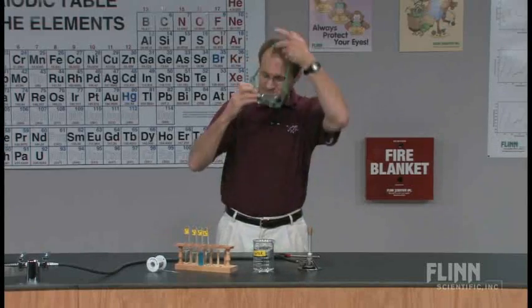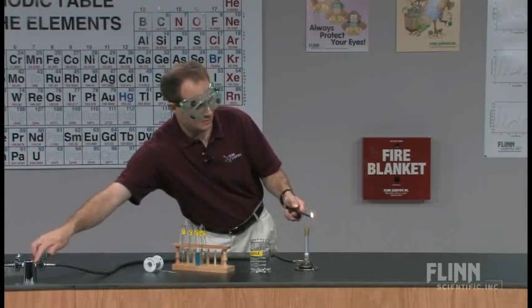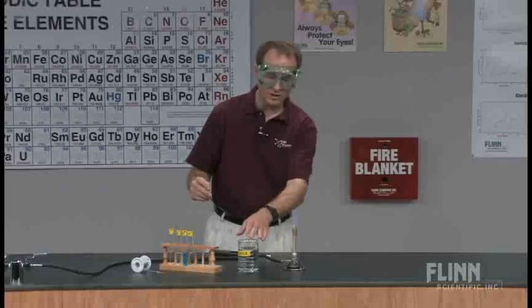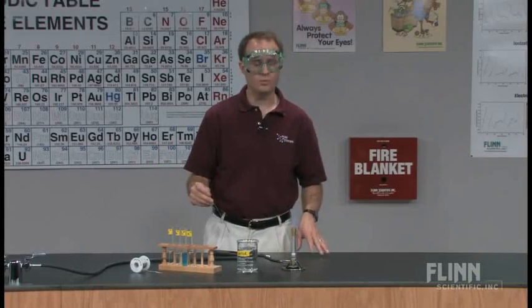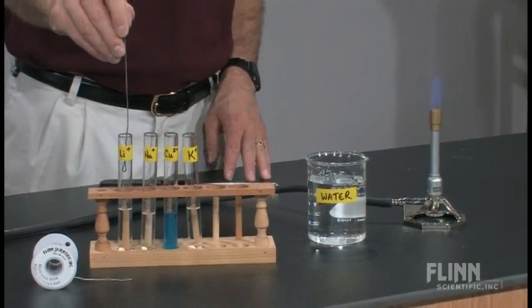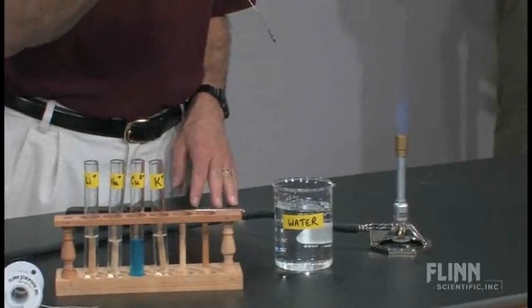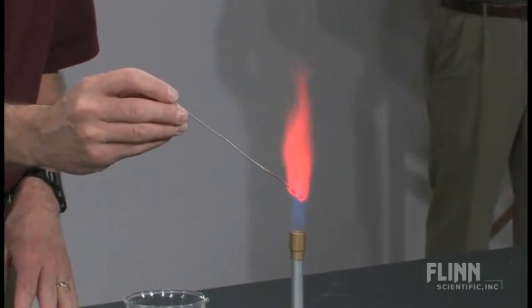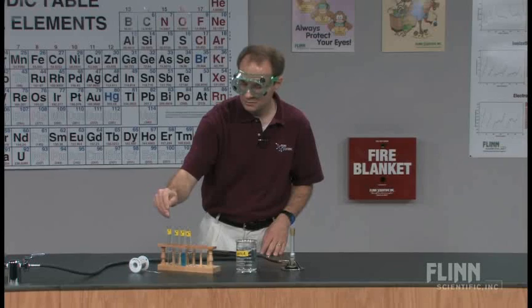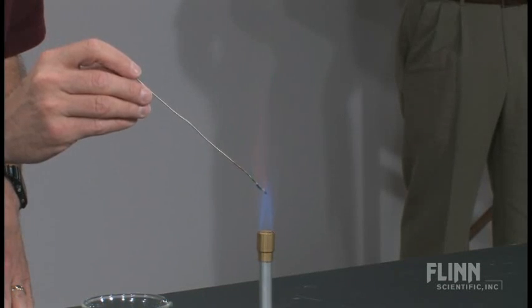I also have a beaker of rinse water so that we don't contaminate as we go from one test tube to another. All I do is take the nichrome wire, insert it down into the solution, pull it out, and carefully bring it over to the Bunsen burner flame.